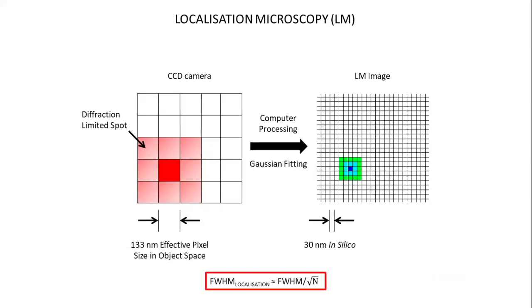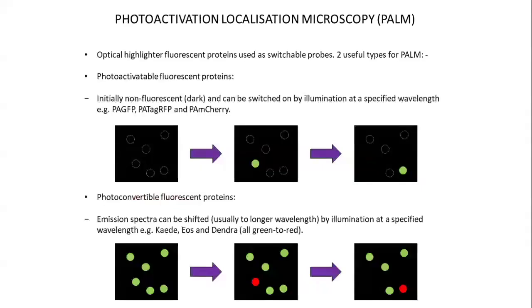on the computer screen. So there's a couple of ways of achieving this. One is by actually having photoactivatable proteins. So photoactivation localization microscopy, known by PALM as the acronym. And these are basically versions of GFP that when they're formed, they basically are dark, they don't emit light. But if you hit them with UV light, typically 405 nanometers in this instance, you can switch some of those guys on. So I can switch on a subset of them, and then I can image that one, and eventually it will actually photobleach. Then I can excite again and start imaging a few other ones.